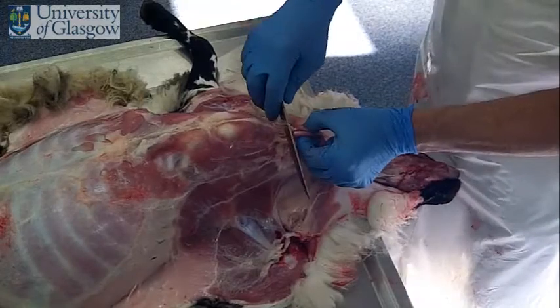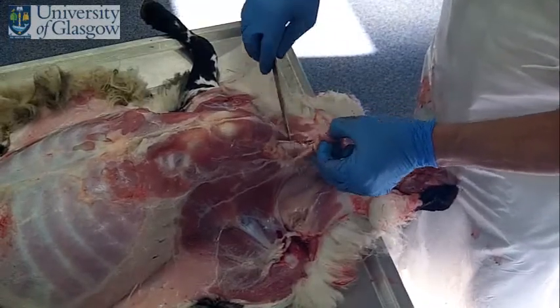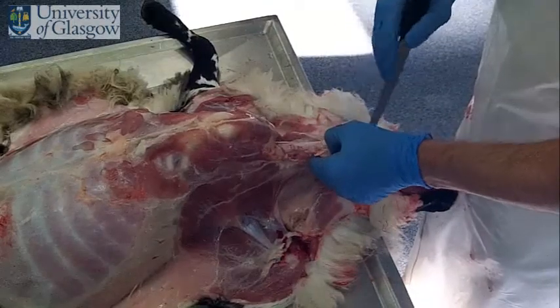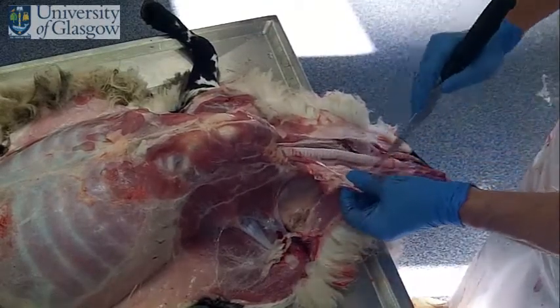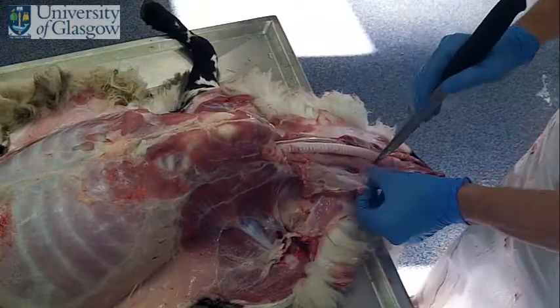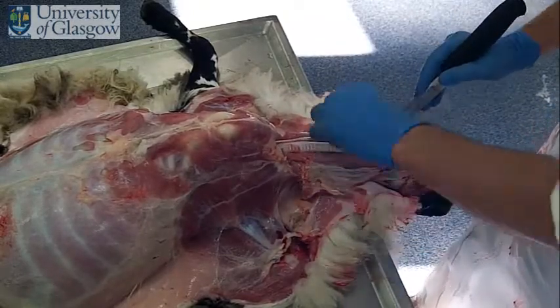I'm just going to take a cut down from the thoracic inlet onto the trachea. Make a midline incision here and just reflect the muscle back on both sides, so we can see the trachea and esophagus running down in here, and also our thyroids.